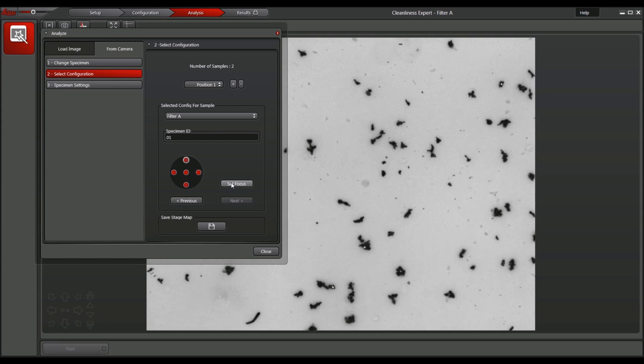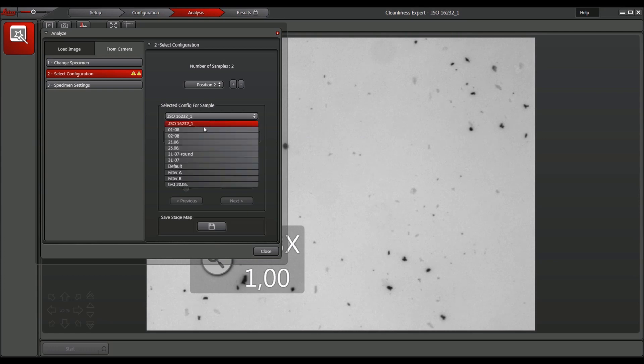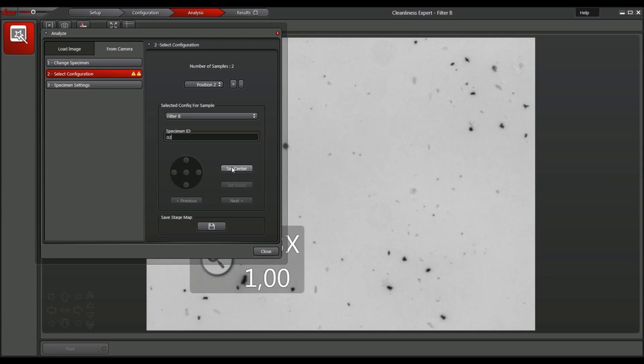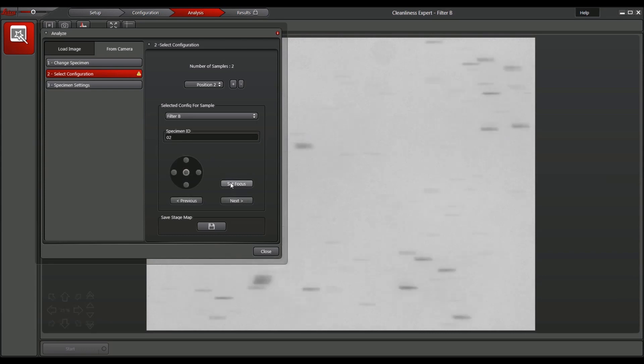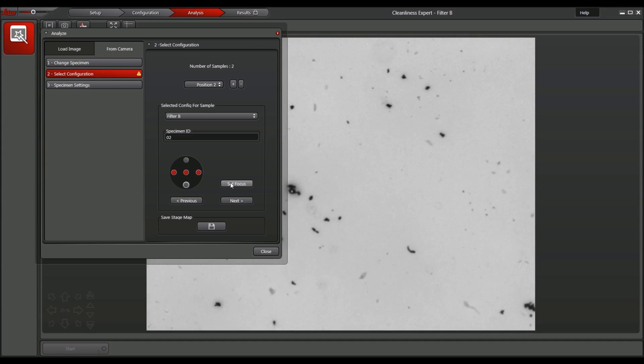Now the first filter sample is ready and the second sample position can be entered. For the next filter sample, the same or a different pre-entered configuration can be selected. This step is important if different samples must be analyzed in one batch.